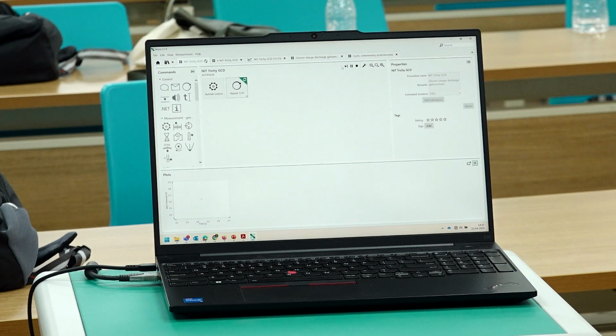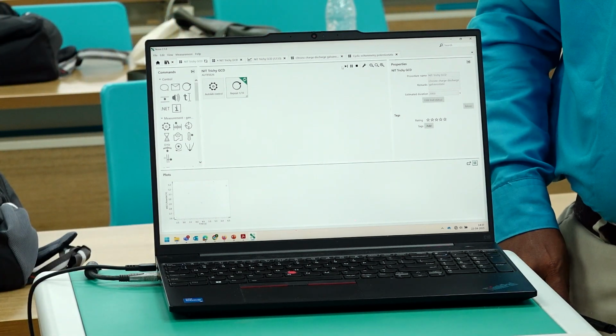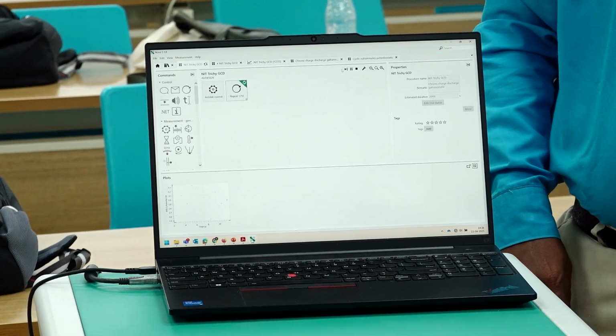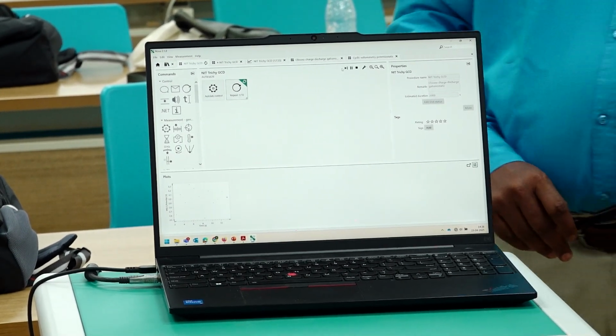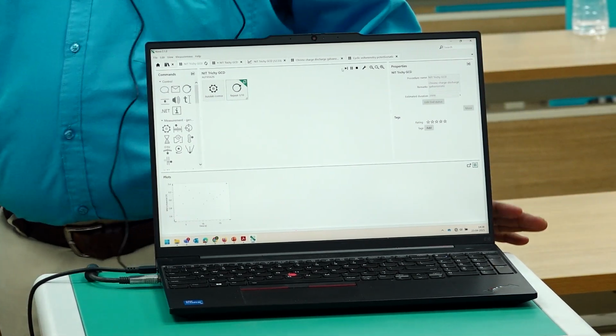The leads are connected to the electrode setup. Working electrode and sense are connected to positive. Reference and counter are connected to negative. The battery is also connected in the same way.